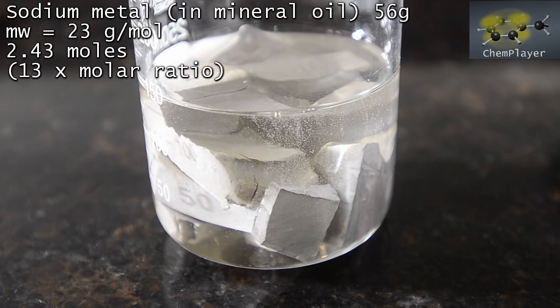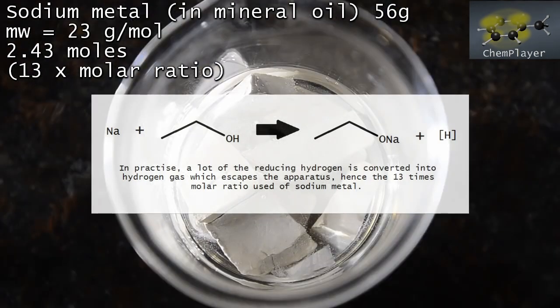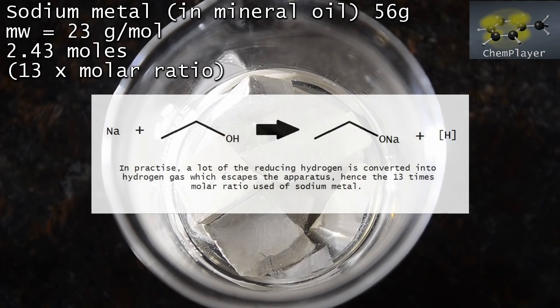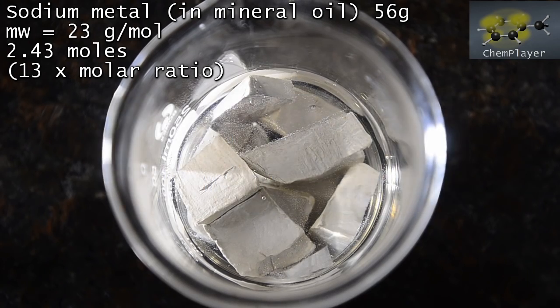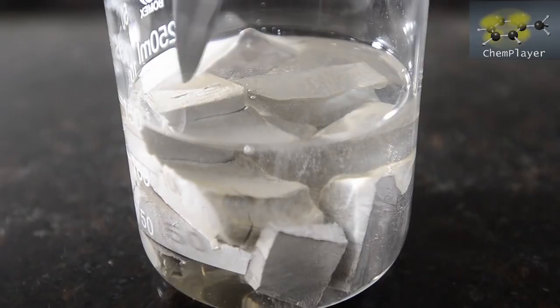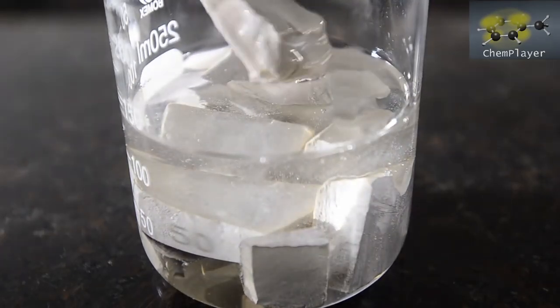56 grams is a lot of sodium metal. Nearly 2.5 moles. But each pyridine ring needs 6 hydrogens adding, and we're adopting the Orgsyn recommendation of using twice the stoichiometric theoretical amount of sodium metal. We then added an extra pinch for good luck, making 13 mole equivalents of sodium compared to the pyridine. We'll need to cut it into smaller chunks which will fit through the neck of our flask, but we'll do this as we need to.